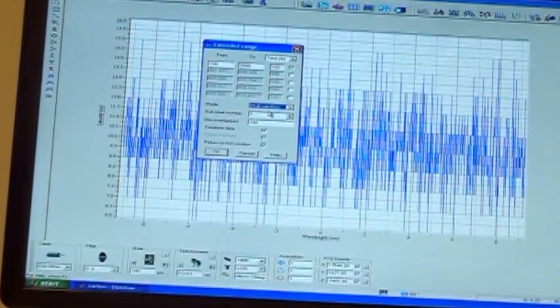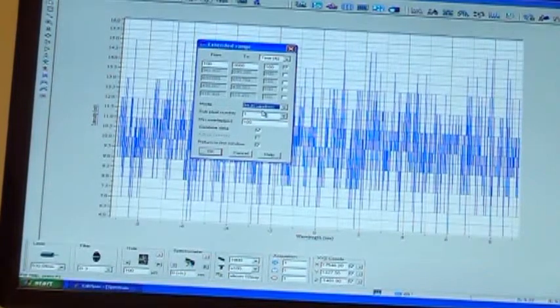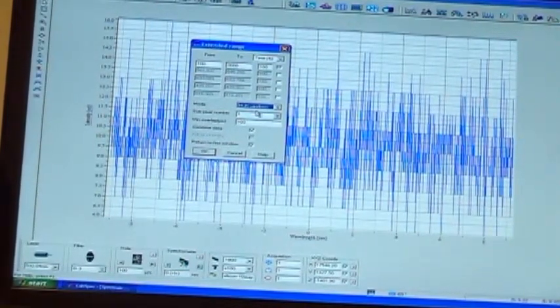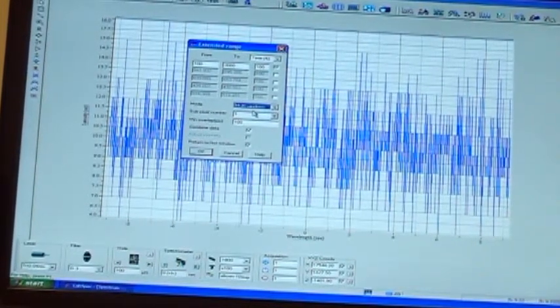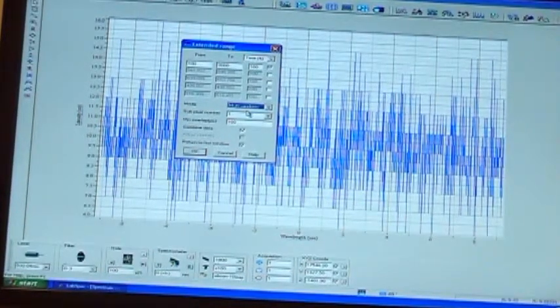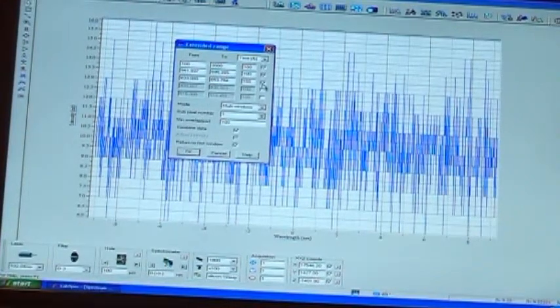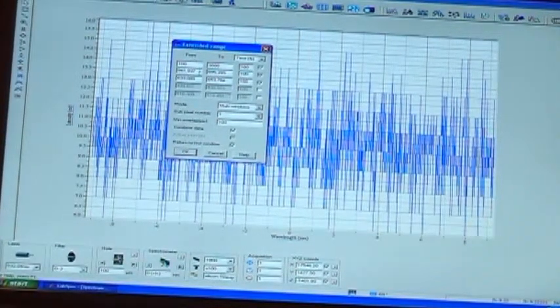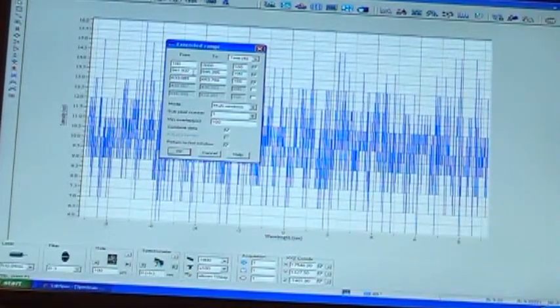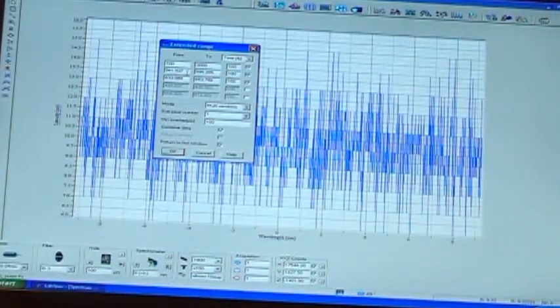Okay. So we have the multi-window area here, and we can also do multi-window and multi-locations. So for example, if you have some data where the only thing you care about is your data from 100 to 500, and then you have more data at 1,000 to 1,500, and then there's other data that you like that's at 3,000 to 4,000 wave numbers, you can set up multiple regions on this, and you can have it just scan those particular areas. Okay. So, if you don't care about the data that's between 1,000 and 2,000, you can have the machine just skip that whole area. Okay. Because why acquire it if it doesn't matter? Right.